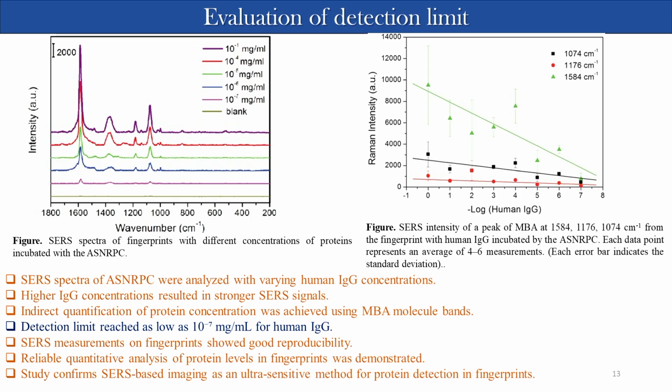And usually we plot a graph, and then you will say what the detection limit is. In this case, they have used 3 wavelengths to detect. And this bar, you might be knowing, what is this bar called?